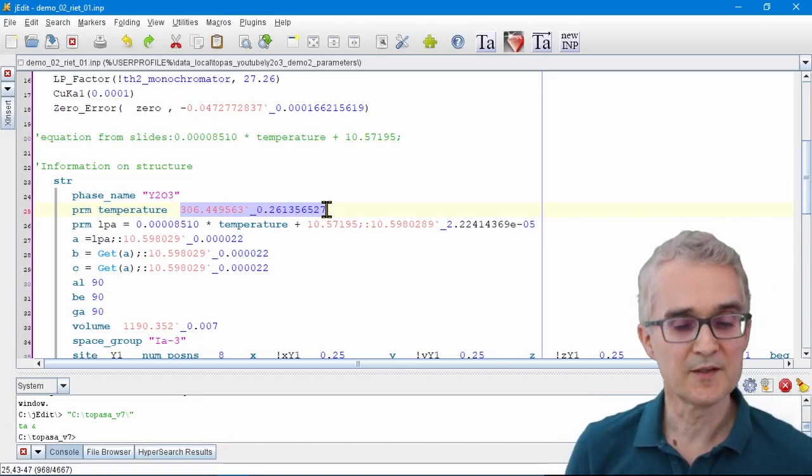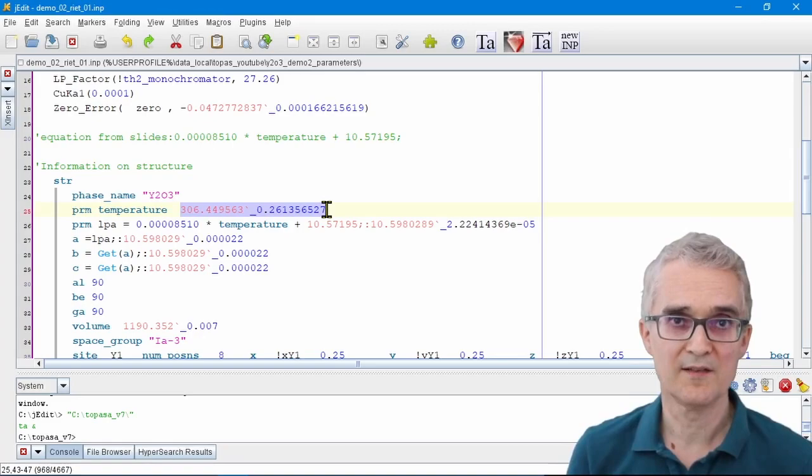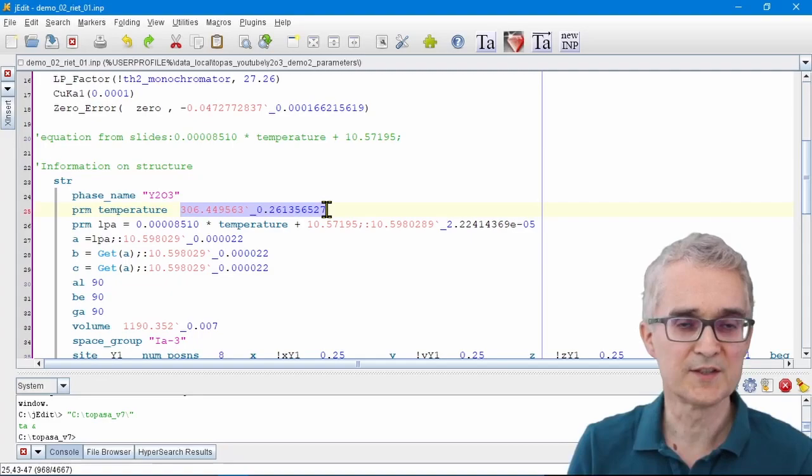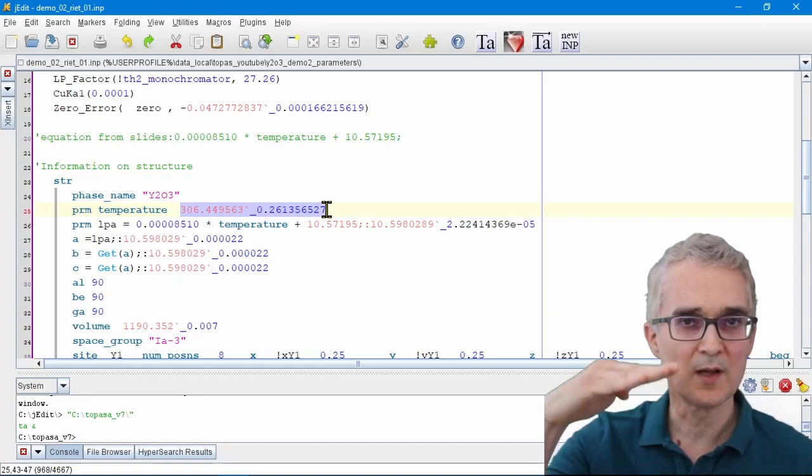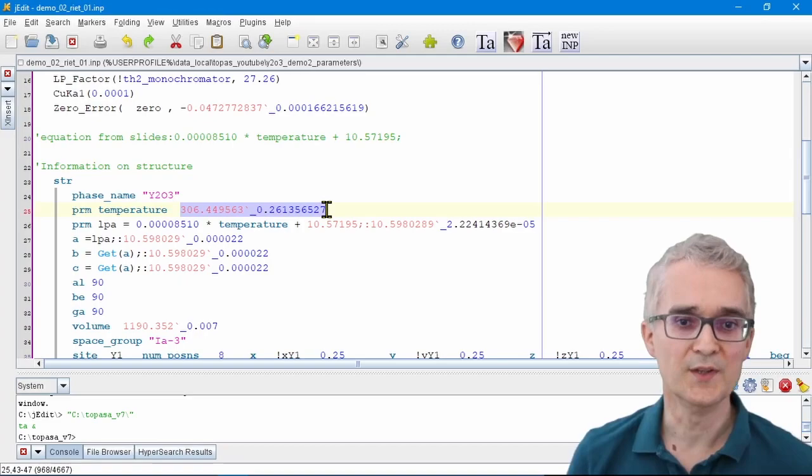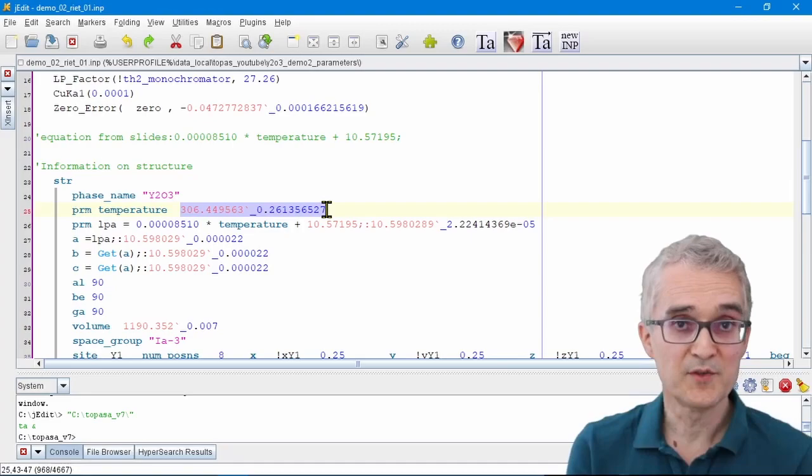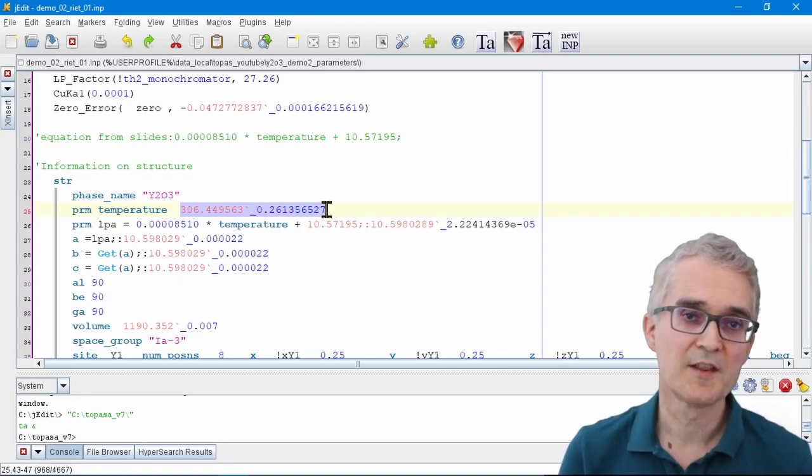So you can probably with this method determine the temperature of your sample perhaps within five or ten degrees Kelvin. You do have to be very careful, though. It will only work if you've got a good idea of all of the other factors that influence the peak positions that you're observing in your experiment, particularly if things like the sample height are changing as a function of temperature or the position of the sample in the diffractometer is changing. You would need to take that into account. But provided you've got all of that handled correctly, temperature becomes a quantity that you can extract from a Rietveld refinement.